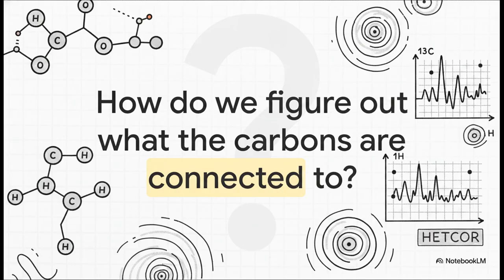Well, for that, you have to literally layer the 1H and 13C maps on top of each other using a 2D technique like HETCOR. But hey, that is a massive, fascinating puzzle for another explainer.